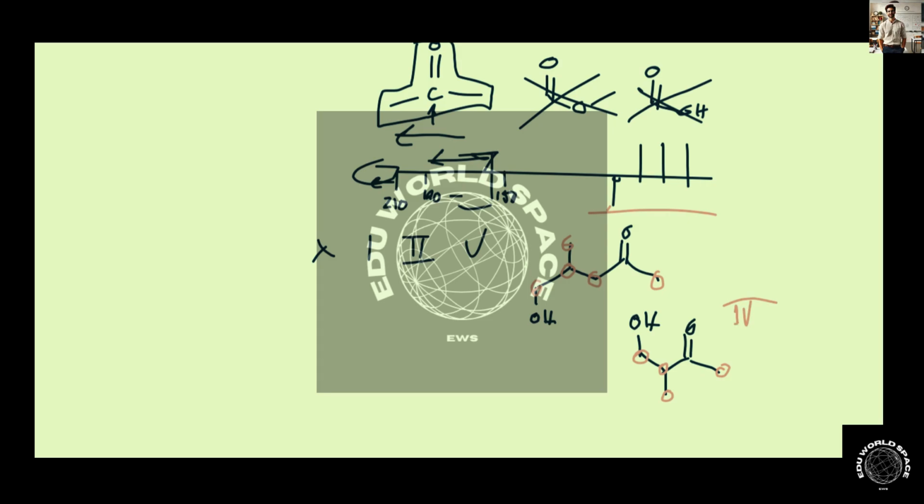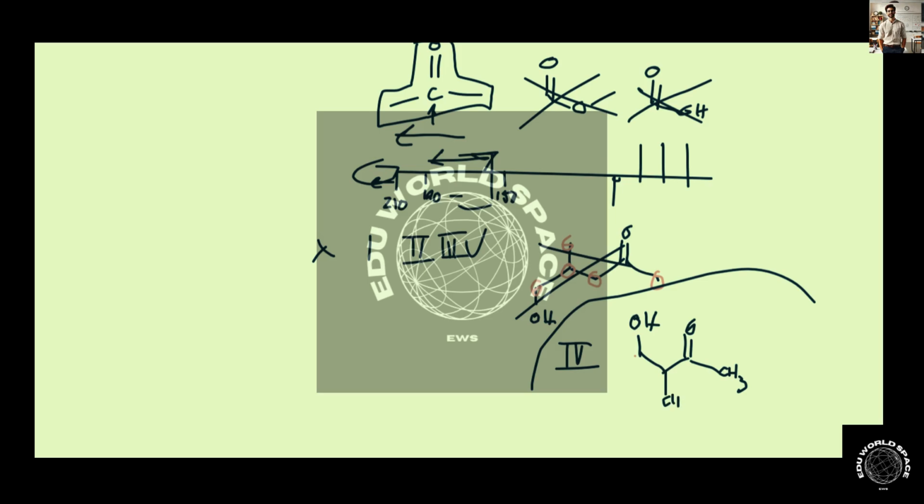So by that rationale alone, we can pretty much already tell that it's 4, but then we can make sure that it also makes sense for what we've got going on. So let's look a little closer at 4 and see if the rest of the DEPT 135 spectrum makes sense. We've already ruled out 1, 2, 3, and 5. We're pretty sure that it's 4, but let's make sure. So this is a CH3, this is a different CH3, this is a CH, and this is going to be a CH2. Okay, so that makes sense with what we see here, right?